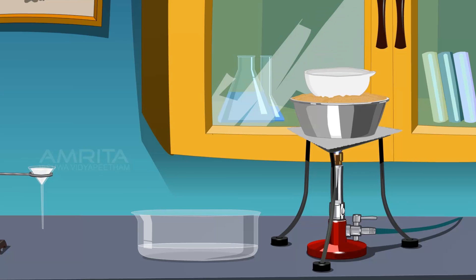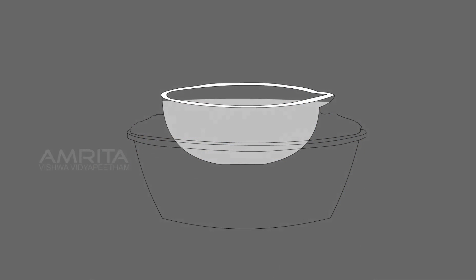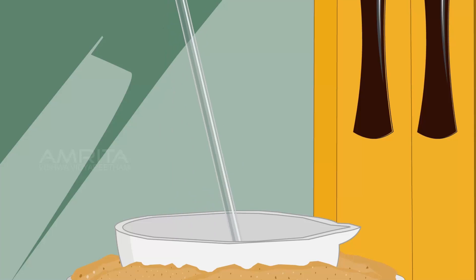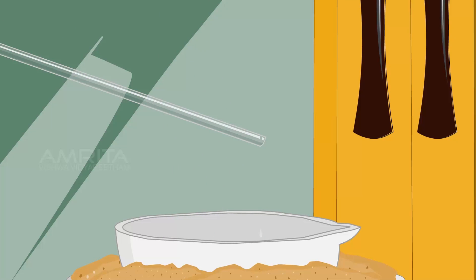Heat the solution in the china dish on the sand bath while stirring using the glass rod to avoid crust formation on the side of the dish. Don't allow the solution in the dish to boil. Continue heating till the solution is reduced to about one third of its original volume. Take out a drop of the solution using the glass rod and cool it by gently blowing on it. The appearance of tiny crystals on the glass rod shows that the crystallization point has been reached.